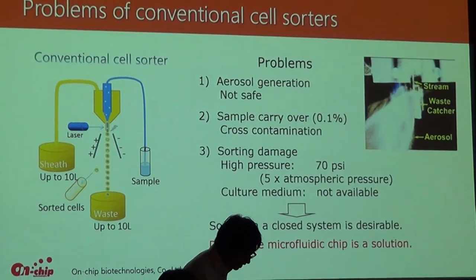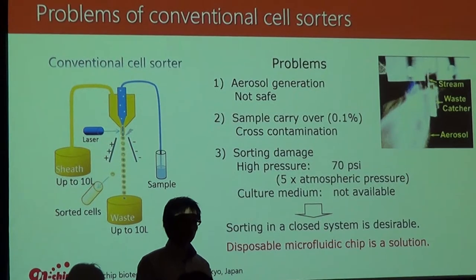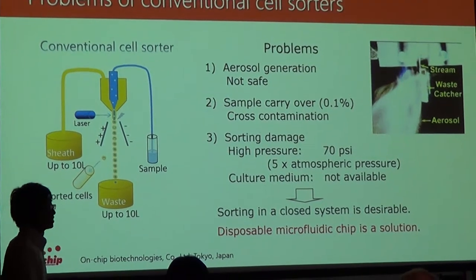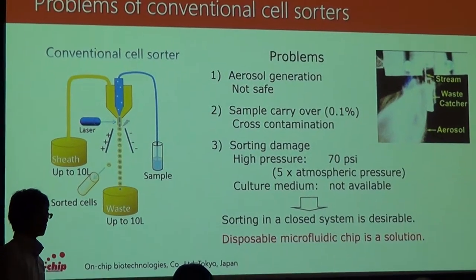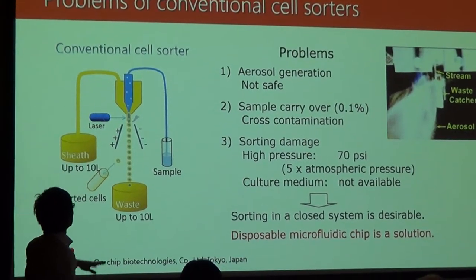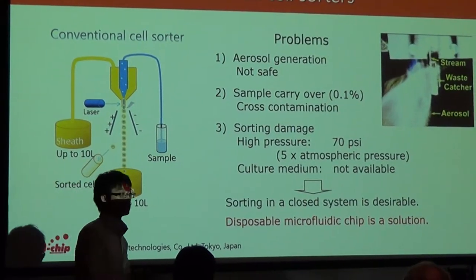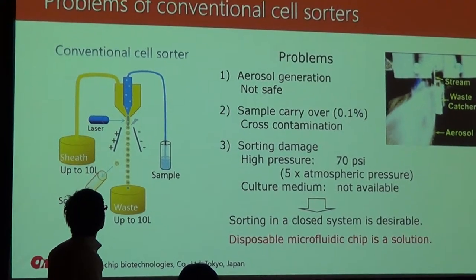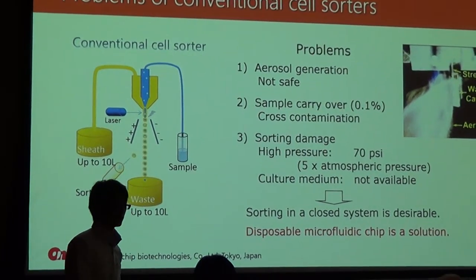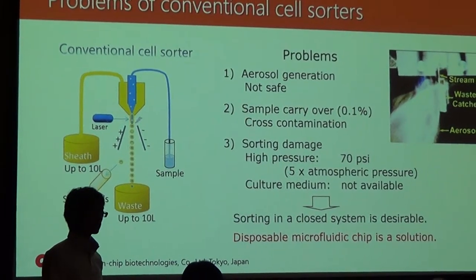Anyway, so I'll just get started on the difference between the conventional sorter and also what we have. First of all, on the left, you can see how it looks in a conventional sorter. What they do is pressurize the sheath and also the sample flow, and squeeze that into a narrow cuvette type of thing. Because we apply such a high pressure to it, it's kind of damaging when all these cells are going through the cuvette.